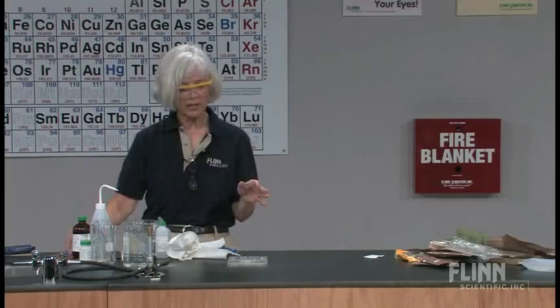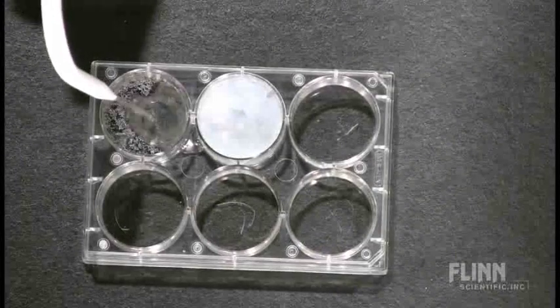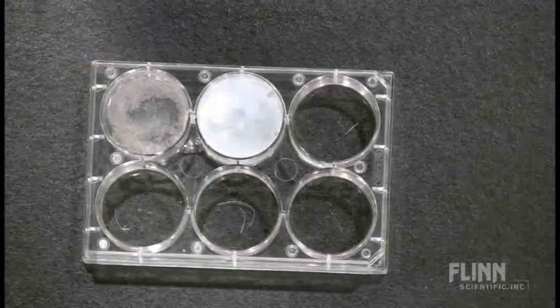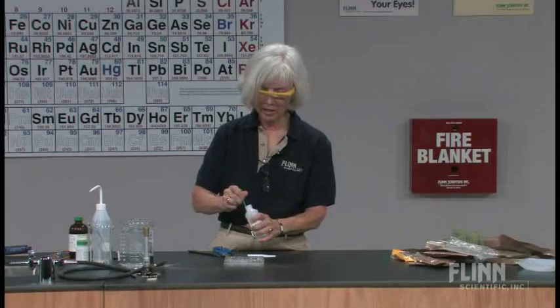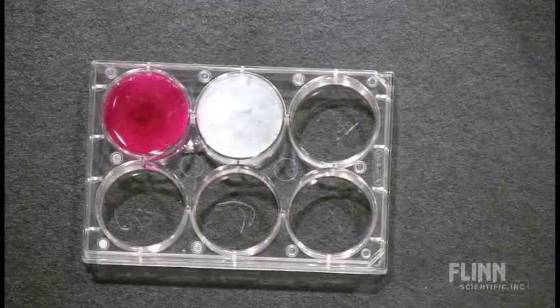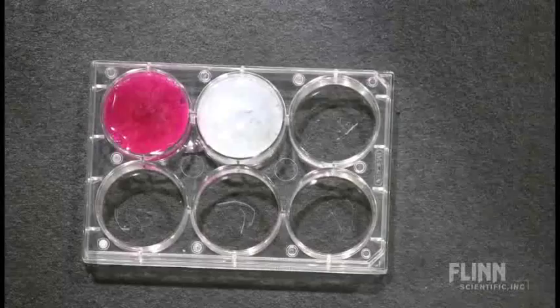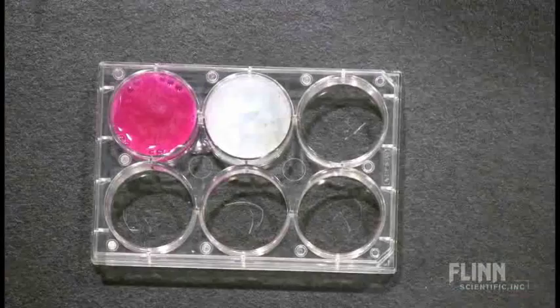That pretty much summarizes our reactants: we have magnesium, iron, and sodium chloride. Now I'm going to take more material and test it again with water, but we're going to add phenolphthalein. Phenolphthalein, as you know, is an acid-base indicator. When we add phenolphthalein, we get that bright pink color. So we know that we're producing a base as part of this reaction. We also see bubbles forming with the water, so we know that one of the products is a gas.